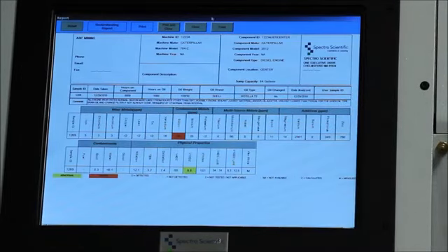You can see that it has all of the information that we entered up at the top here about the equipment and the oil. Down at the bottom is all of the analytical data with the metals analysis here, up to 20 different elements. We have the oil chemistry here at the bottom and the viscosity as well. And if we had run a transmission fluid or a hydraulic fluid, it would have also run the particle count information, and that would have shown up here.